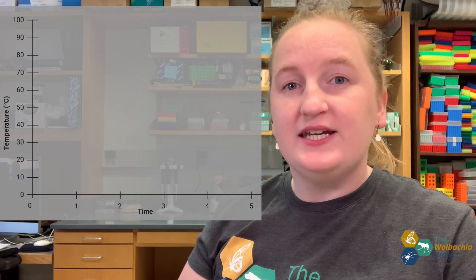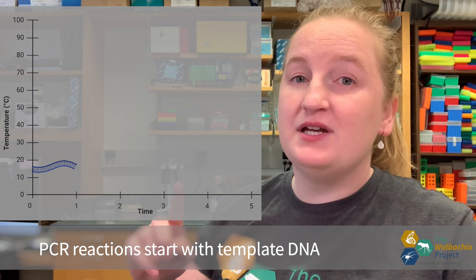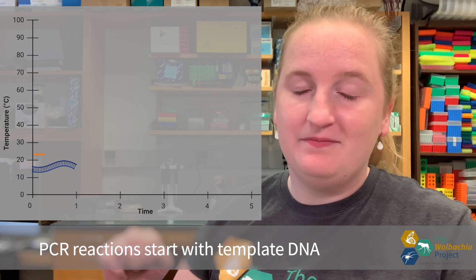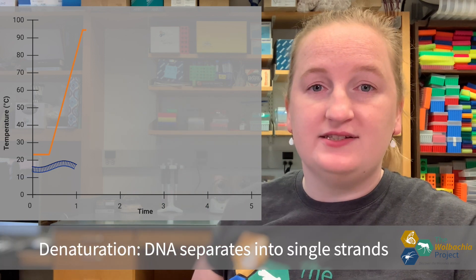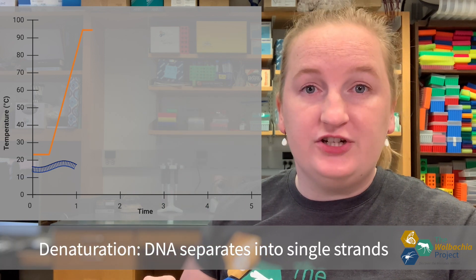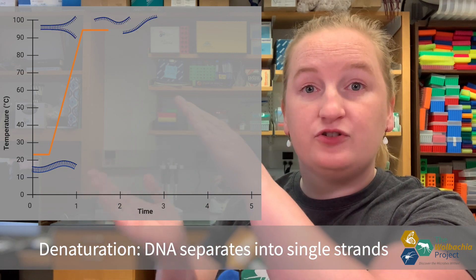That's the beauty of PCR. PCR uses heat to control the replication process, so that one copy of DNA can become a billion copies of DNA. First, our PCR reaction is heated up to 94 degrees Celsius. This is the denaturation temperature, or the temperature where the DNA separates from a double strand into two single strands.